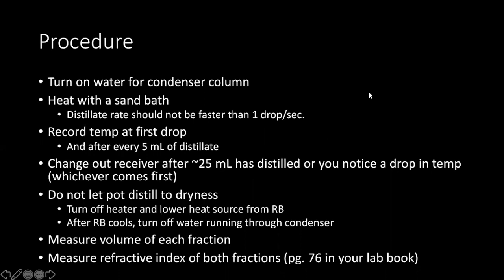Remember, after you've put together your build and gotten the go-ahead from your TA or from me, your professor, you should turn on the water for your condenser column. We want to make sure that the water hoses are connected correctly when we're doing the check, but then you'll want to turn on that water so that your vapors will eventually be able to condense and be collected.